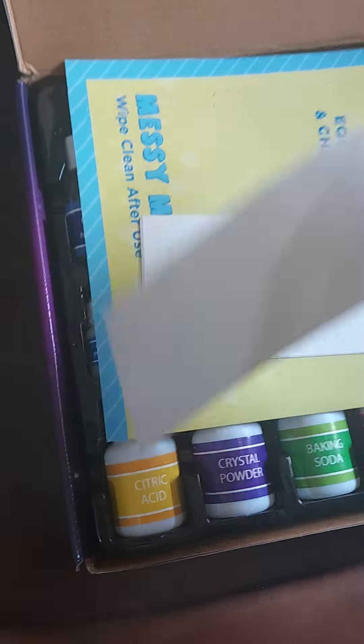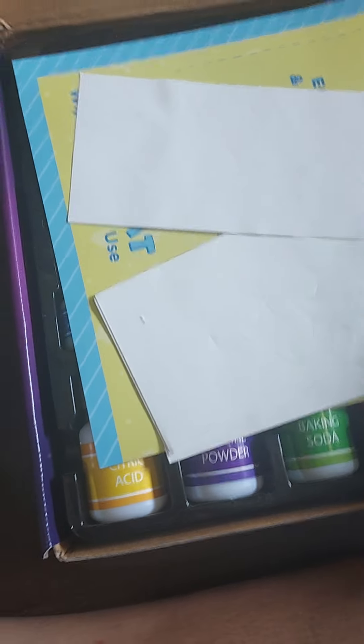I will remove these. There are some papers which are going to be used in the experiments. I don't know the exact use of this, but you can see here are some shapes on them.